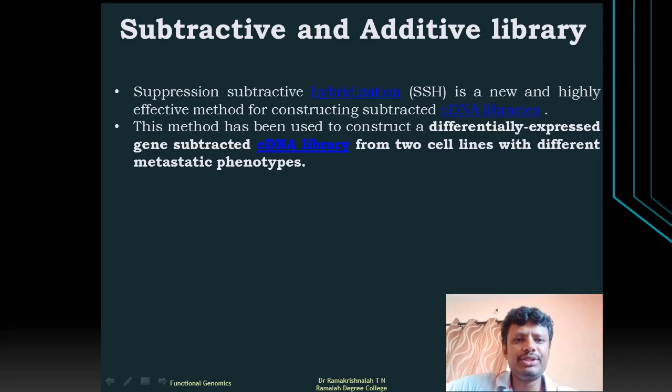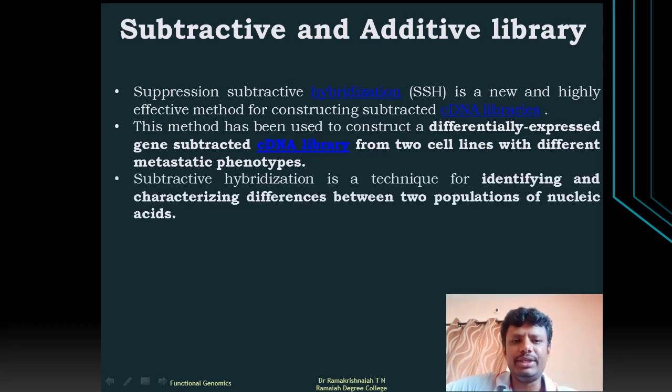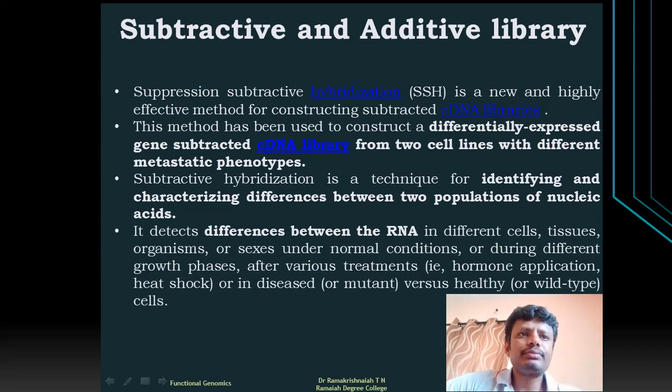The two express two different types of mRNAs with a slight differentiation. We don't know whether it is exactly differently expressed or not, so we can only know when we do this assay. When we take two different populations for evolutionary or genetic aspects, it's very easy. But when we take the cancers of the same cells displaying differences, then it becomes a little complicated.